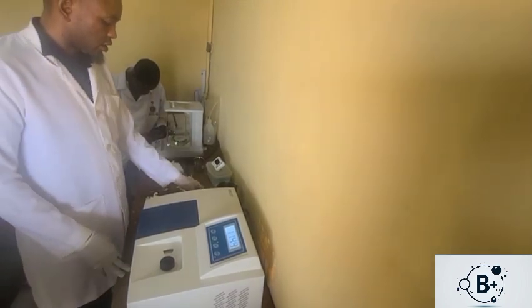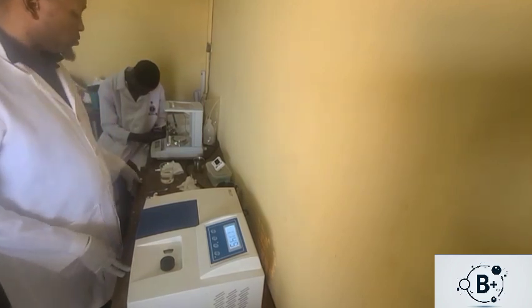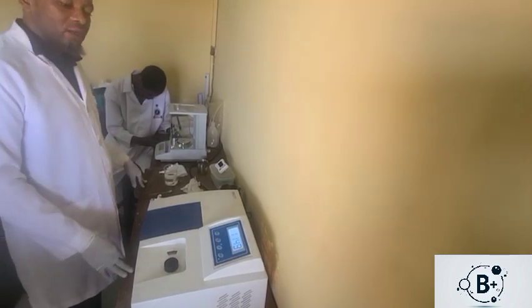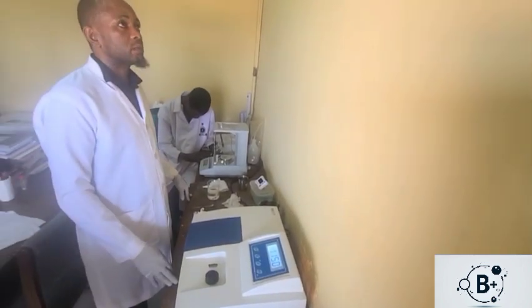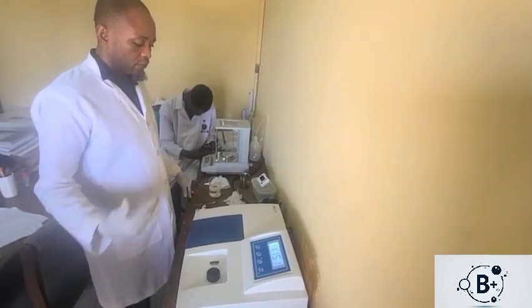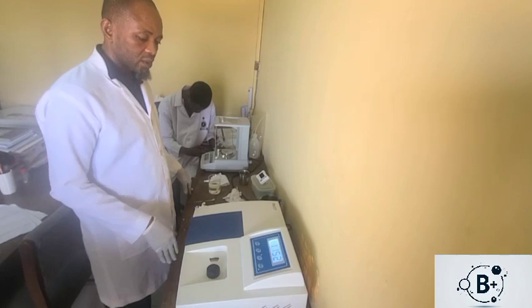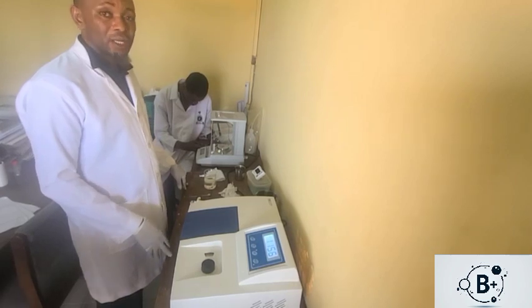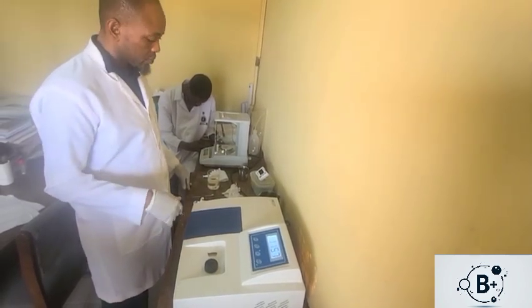So anytime we are having ethanol in a mixture, we have to increase the volume at least. We have to double it or triple it, and we give room for the volatility of it. So in case it evaporates, we know we still have a volume that will be enough.